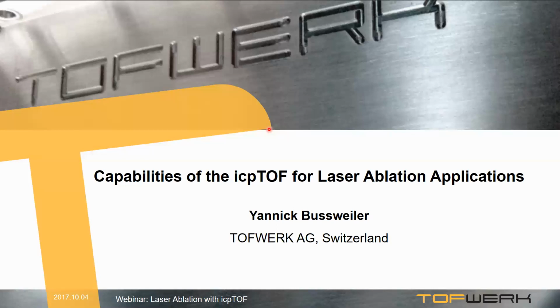So my name is Yannick Bussweiler. I'm an application scientist here at Tofwerk for laser ablation, and I'm actually a geologist by training, so I apologize in advance that the examples today will be biased a little bit towards geological applications, but I will also try to add some biological examples as well. The title of today's webinar is Capabilities of the icp-TOF for Laser Ablation Applications.